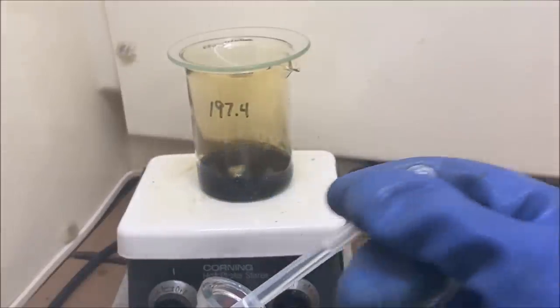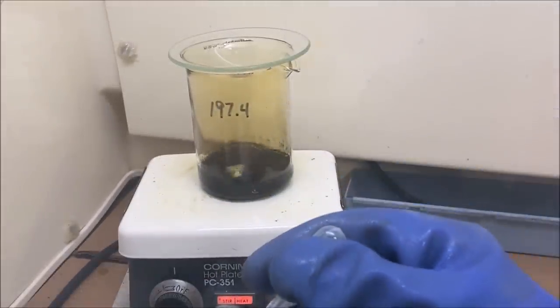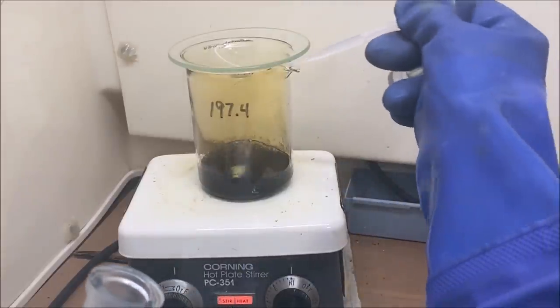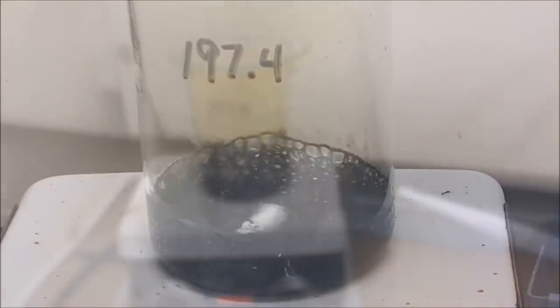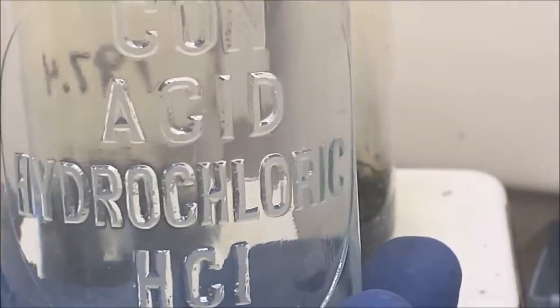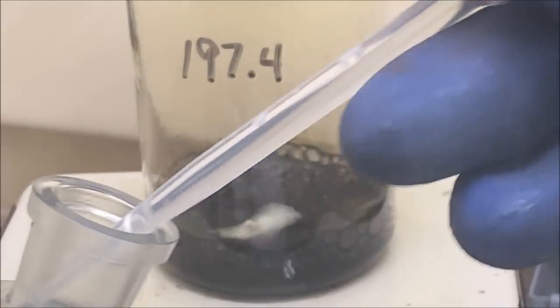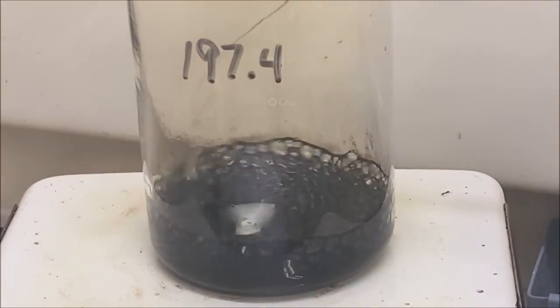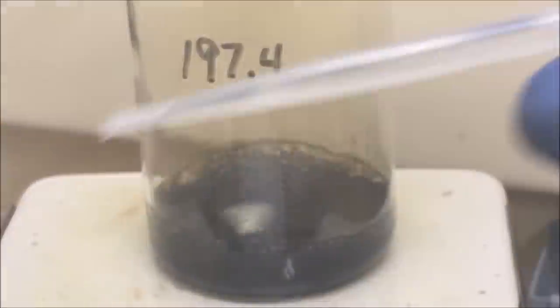And this is a classic evaporation to a syrup technique for driving off the excess nitric. It's something that I normally do not do in my refining practices, but it is a valid way to remove excess nitric if we suspect we have nitric in our solution. This will even work for gold refining as well.